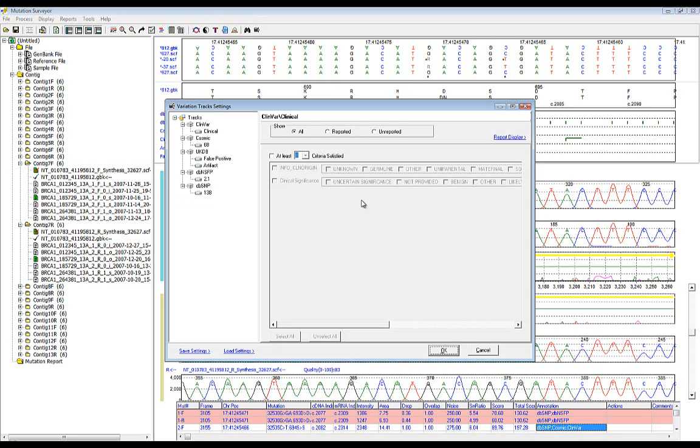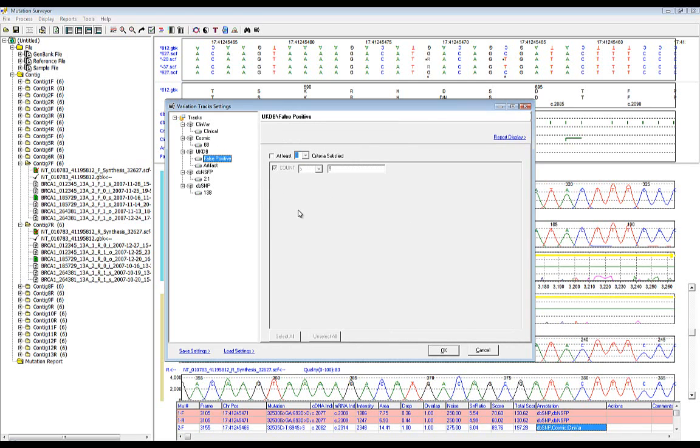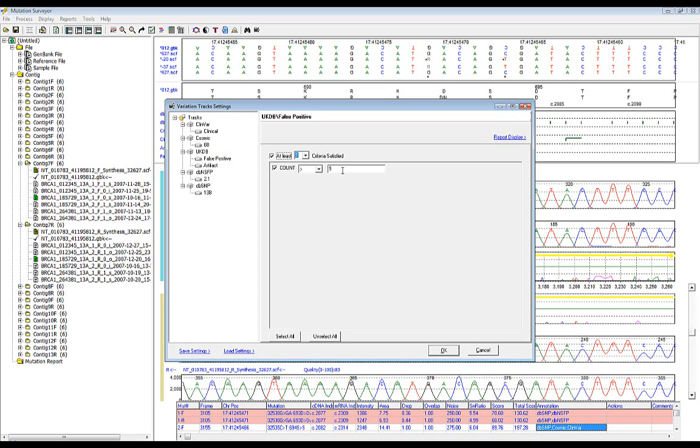The main settings window allows you to filter mutations based on database annotation. For example, the external databases can be used to filter variants that meet certain criteria, such as clinical significance for ClinVar and prediction scores for dbNSFP. To adjust these settings, simply click on the database version in the left-hand column. The user knowledge database entries can also be used to filter variants by setting an entry count threshold. To adjust these options, set the number of false positive or artifact counts that must be added at a position in order for it to be eliminated from the mutation report. When the count threshold is met, that position will be queried in all other traces in the mutation project.